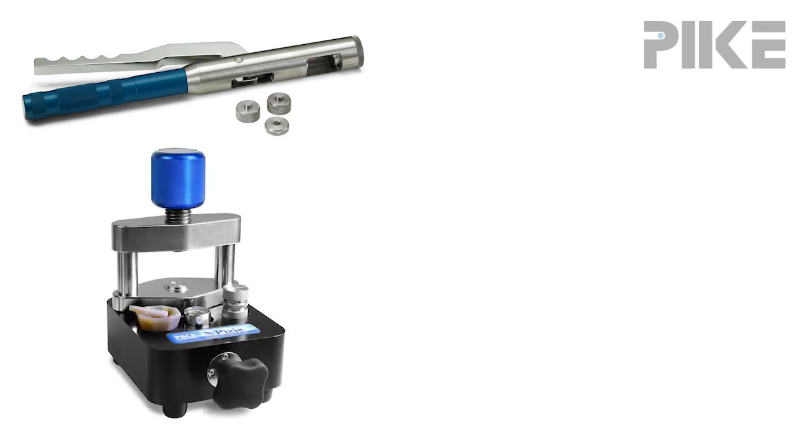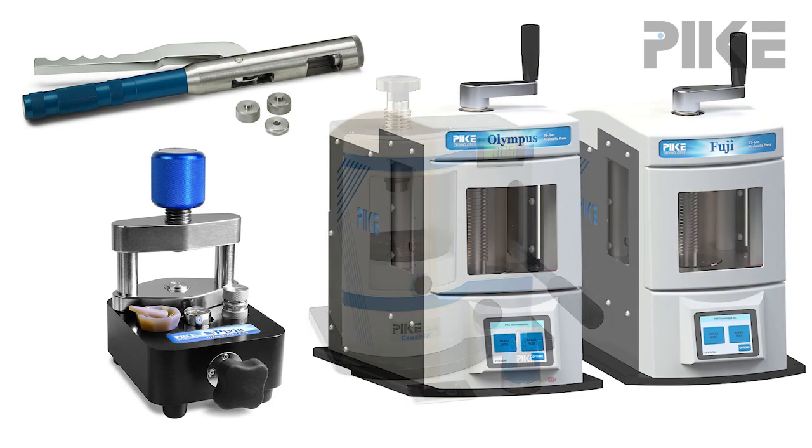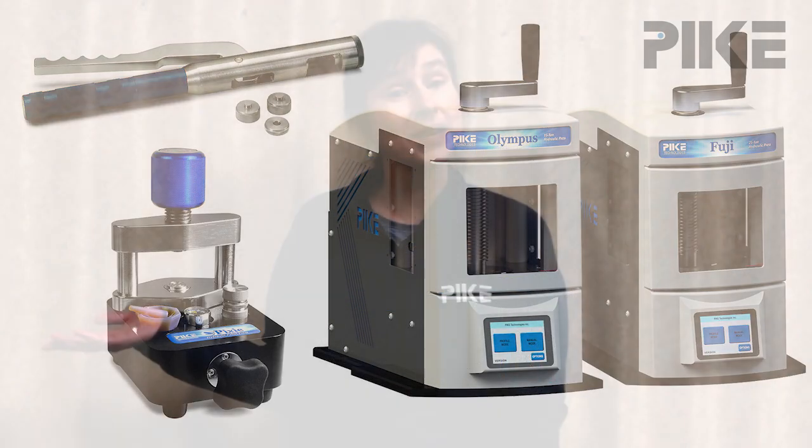At Pike we have a wide range of pellet making tools, and that goes from the hand press to the Pixi small portable press, to our 15-ton crusher hydraulic press, all the way to Olympus and Fuji automated presses.